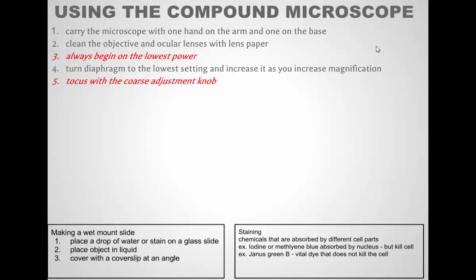Once we have our slide on the stage, we focus using the coarse adjustment, the larger of the focusing knobs. Once it's in focus with the coarse adjustment, then we can use a fine adjustment to make any fine tuning of that image. We center the object. Sometimes with certain microscopes, you just use your hands to move it around to get the object you're looking at centered. With other microscopes such as these, they have the mechanical stage, where you have these dials that move the slide left and right, forward and back. So it depends on what microscope you're using. This is called the mechanical stage.